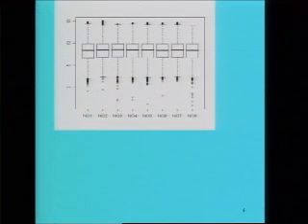The next step is always to draw box plots of all the expression values on all the 24 arrays. Here is a picture of box plots of 8 arrays which correspond to non-obesity. NO1, NO2 and so on up to NO8 indicate that these are the gene expression values from 8 arrays coming from the non-obesity group.